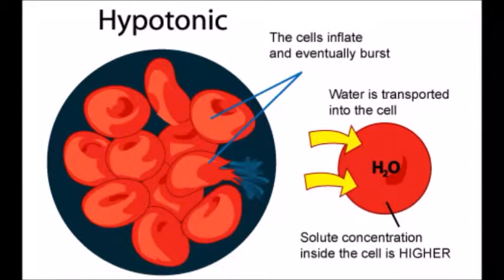Osmosis occurs only when the membrane is permeable to water but not to certain solutes. Thus, cell osmosis can be investigated by using the mammalian erythrocyte, which contains hemoglobin. When red blood cells are immersed in a hypotonic solution, water influx is greater than water efflux. This causes the cell permeability towards hemoglobin to increase and the cell becomes round and swollen. Hemoglobin and intracellular components diffuse out of the red blood cell.